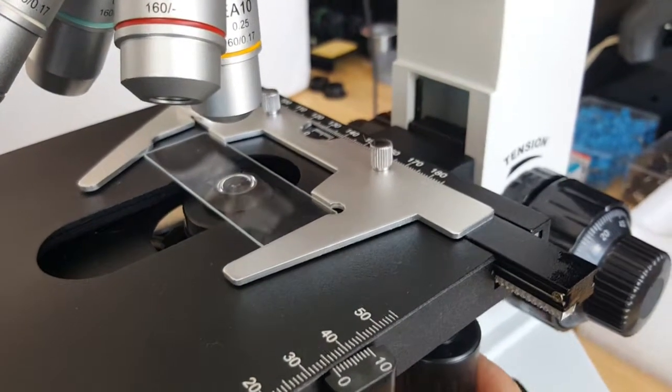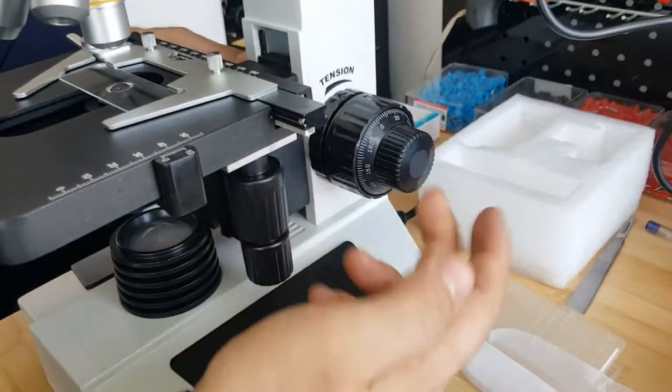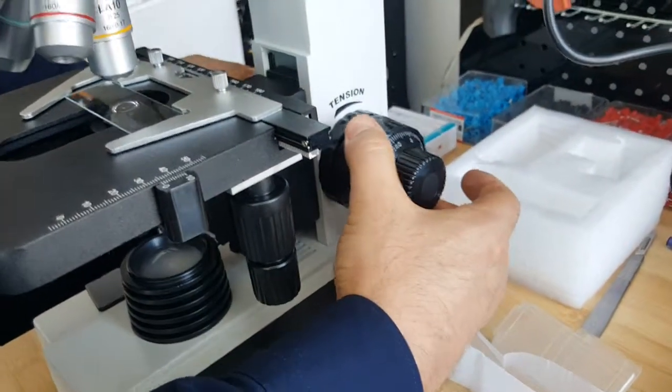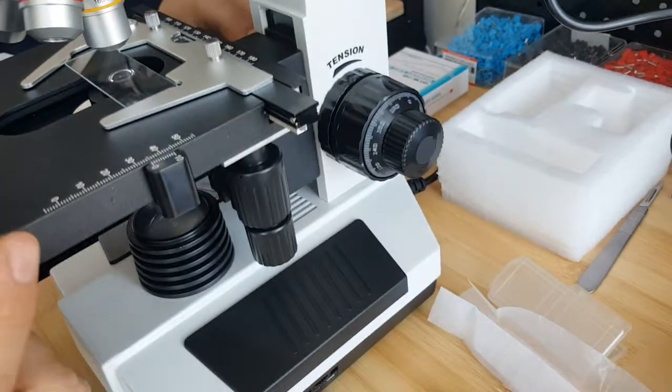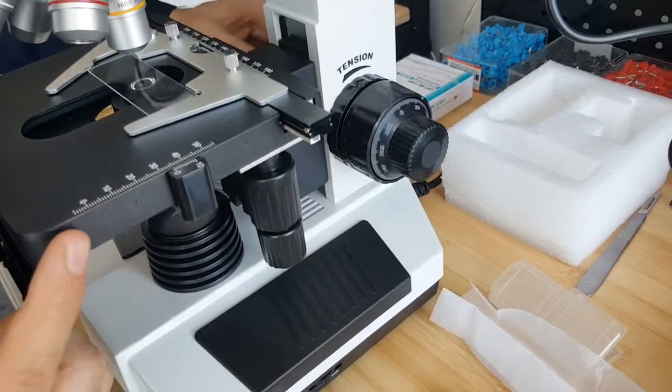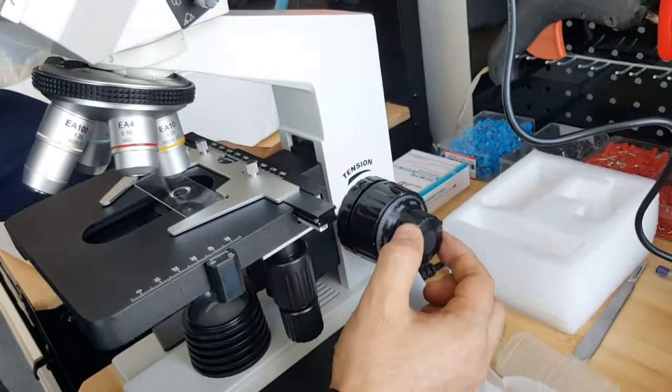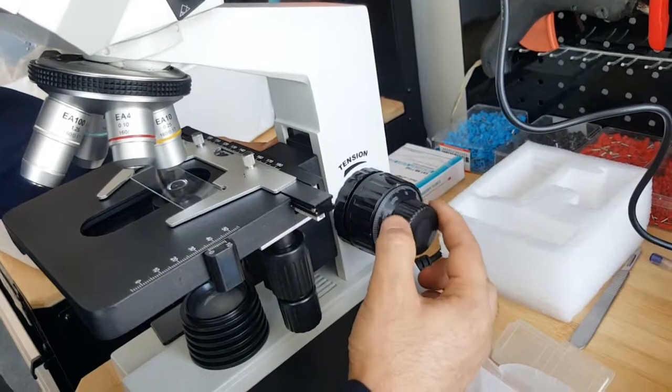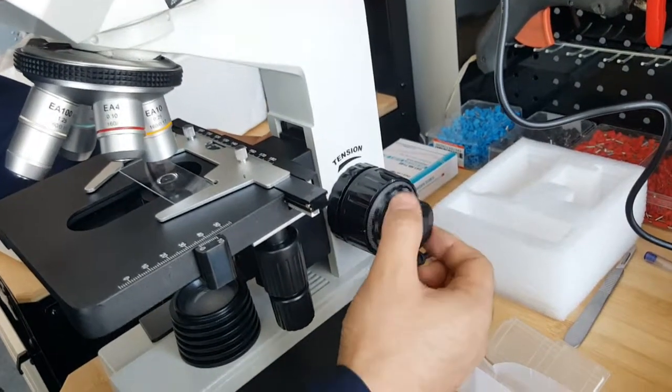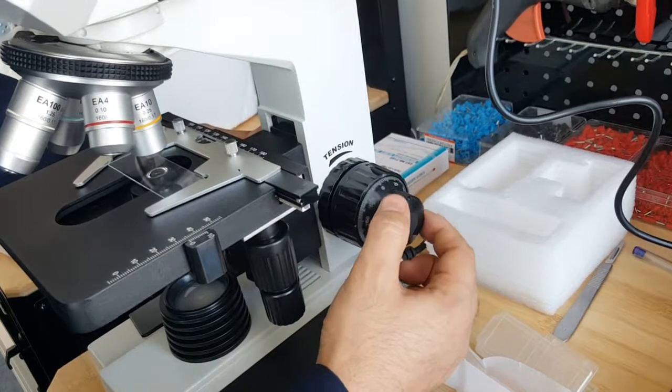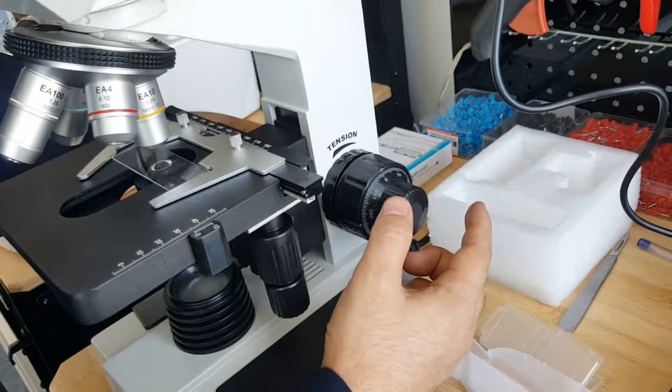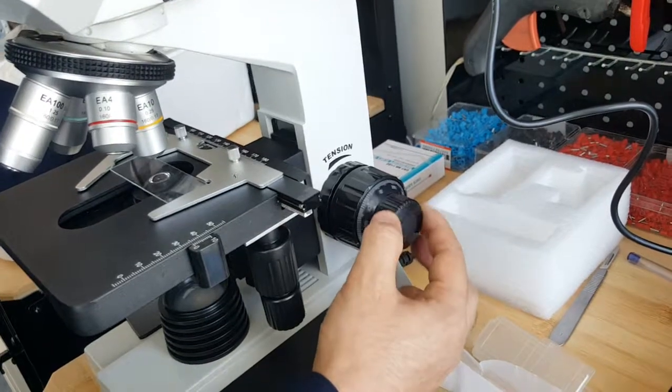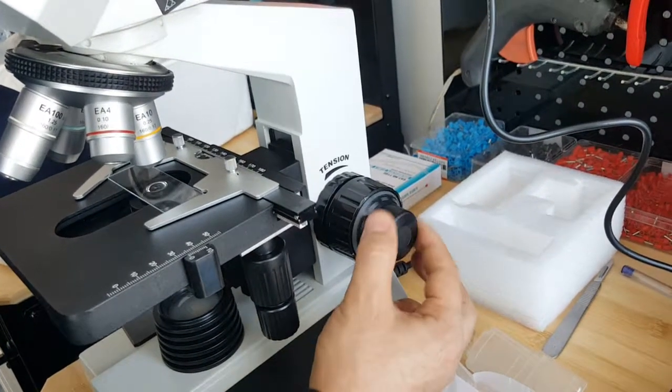And we have height adjustment. This wheel adjusts the height of the table, that is Z direction for the table. And also in this wheel we have a fine adjustment. When you are rotating this wheel, it just moves the table very finely. For big movements use this wheel, and for fine adjustments you will use this wheel.